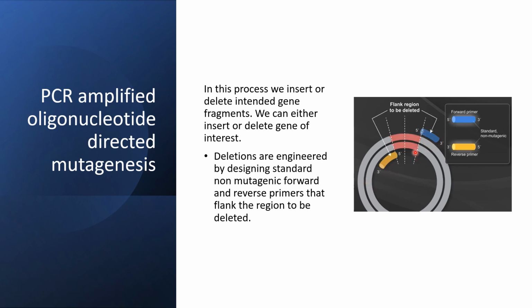As a result, this part of the gene that we want to delete is flanked by both primers.